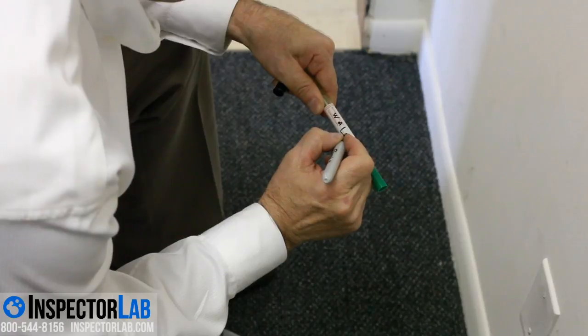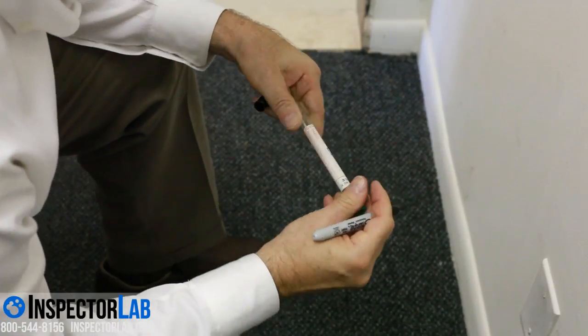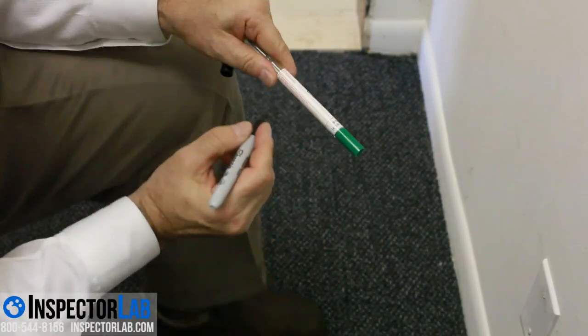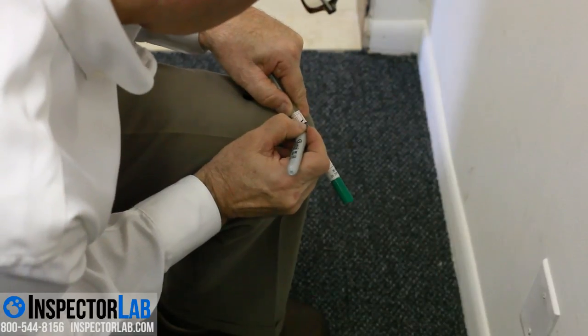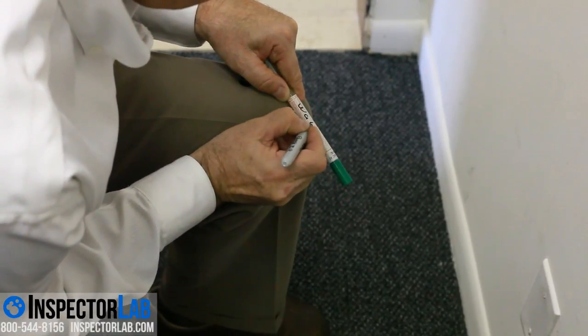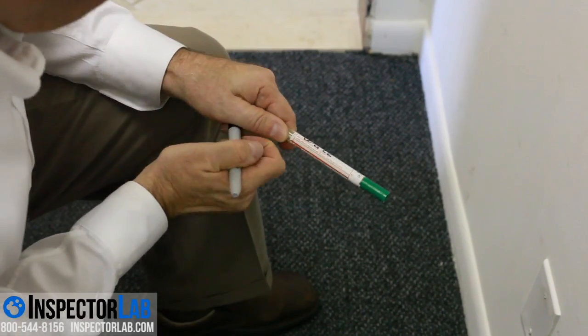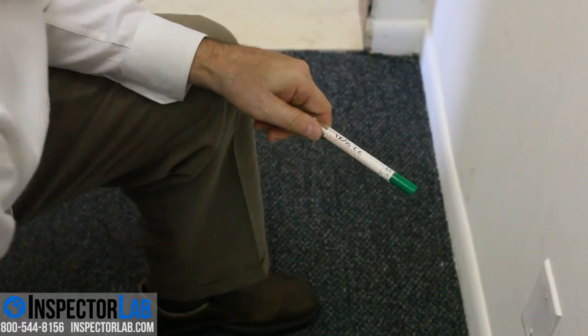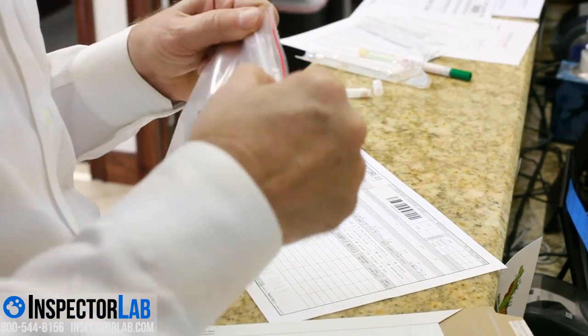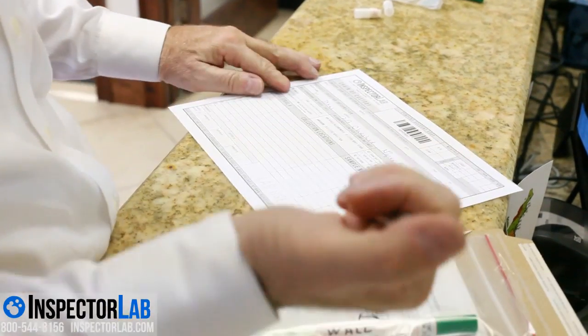Label the swab tube with the sample location and a serial number of your choosing or one that was assigned within the Inspector Lab application on your mobile device. Normally swabs are labeled swab number one, swab number two, etc., and the sample location is recorded on the chain of custody or in the Inspector Lab app on your mobile device.